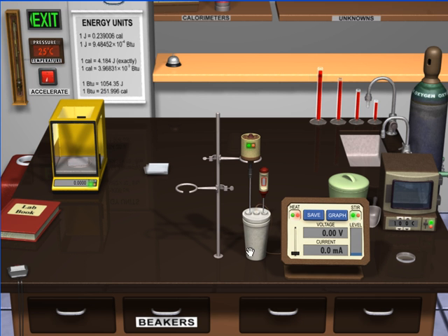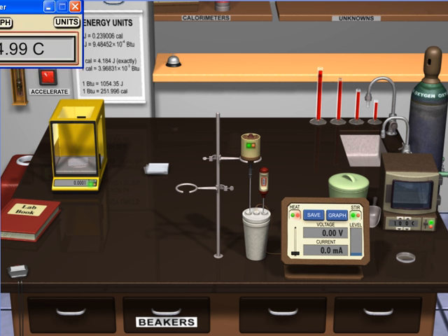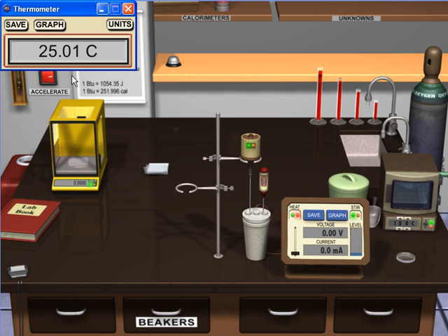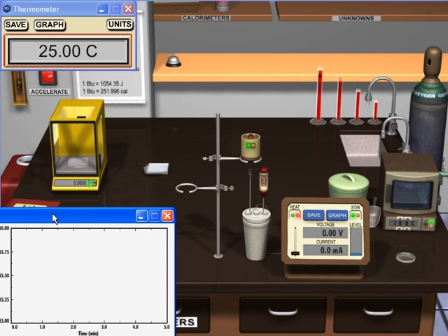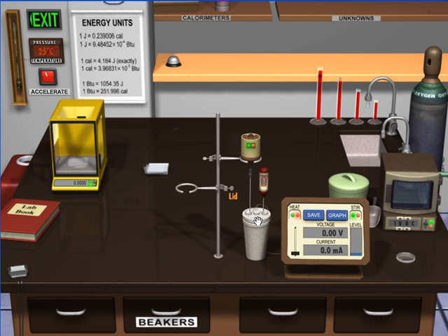While we do that, we've got our calorimeter here. We've got a little styrofoam cup. We'll turn on the thermometer. I already have 50 milliliters of water in there. Let's pull this thermometer in. There, we've got it. We've got a graph for that. Temperature, time. So you can see our graph starting to come along. 50 milliliters of water. Of course, the density of water is 1 gram per milliliter, so that's 50 grams as well. Drop the lid over there.